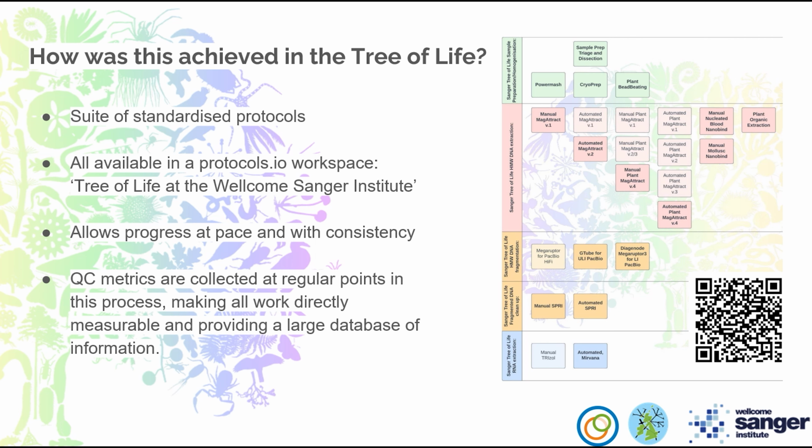And what this means is that we've developed a kind of modular approach, which means that we can really progress at pace. We can have routine QC, the same metrics that are collected at the same points for all of our samples going through. And it means that at the same time as publishing genomes, we're also learning from that data set as it goes through. So we can learn and evolve at the same time. So I'll take you through each of these steps in a little bit more detail and describe what the protocols entail.